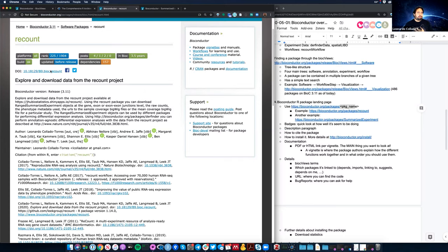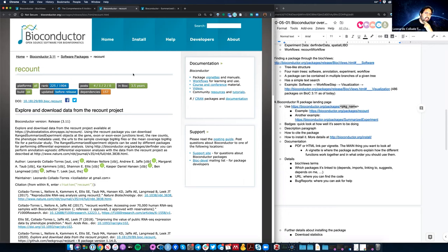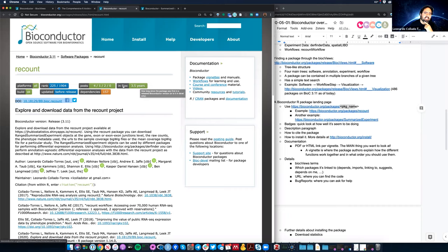At the very top of the package landing page, we find the package name and the Bioconductor version it's tied to. We have 'recount' and seven badges. The idea of the badges is that a user can look at them fairly quickly and get an idea of whether this seems like a good package to use. For example, one badge shows how long the package has been in Bioconductor — recount has been there for three and a half years — meaning the author has kept it working.